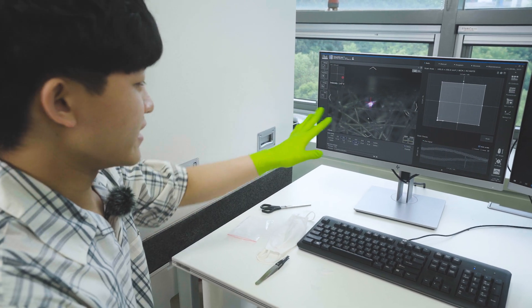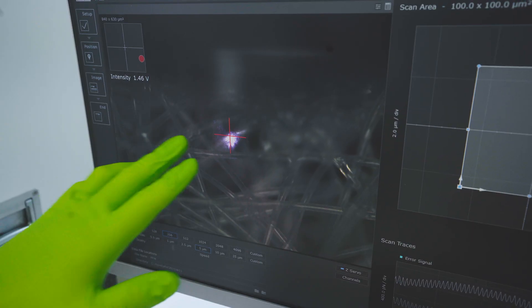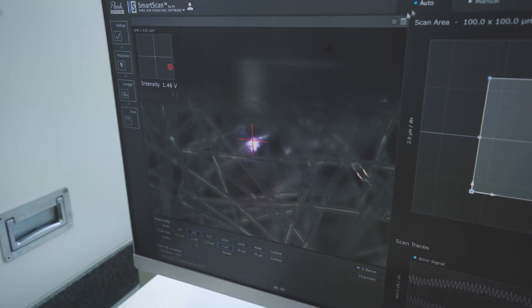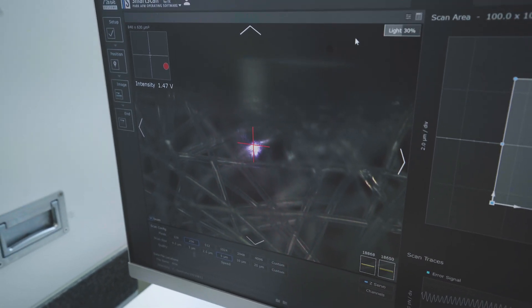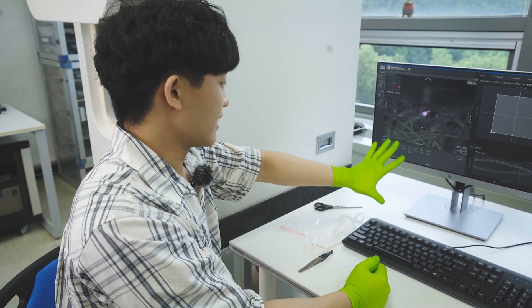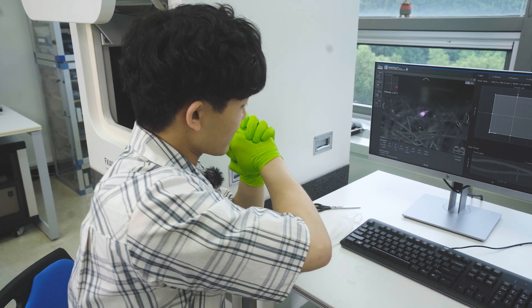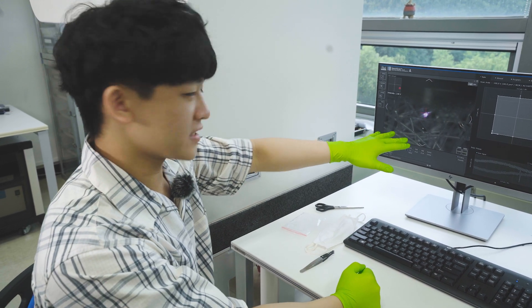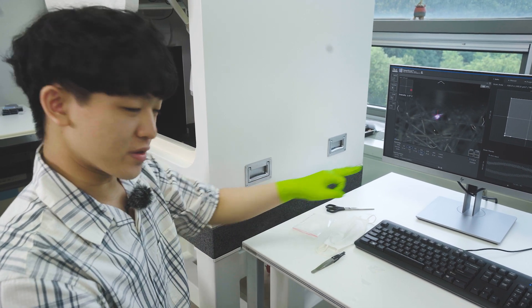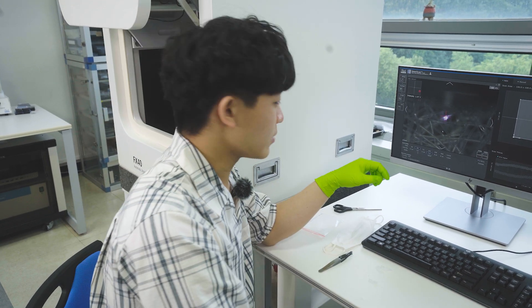Here we can see the mask filter up close with just the optical microscope. It's a lot larger than I expected — for us to be able to scan at the nano scale, we would have to go much smaller. We can already see what the filter looks like here, but surprisingly this is a bit too big to scan with the AFM, so we're going to move on to the next sample.